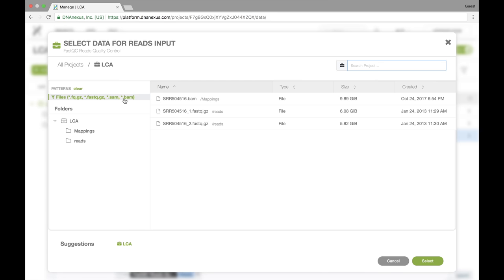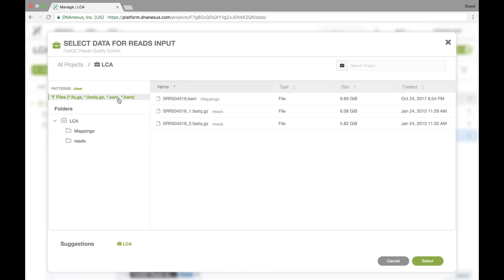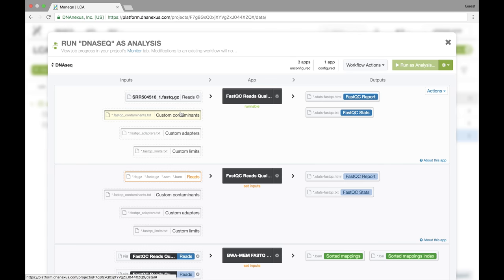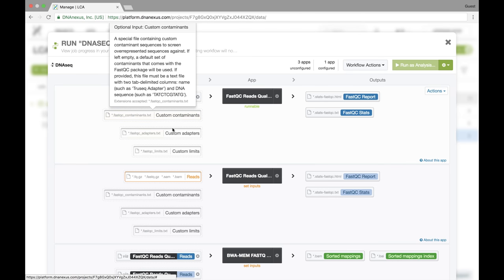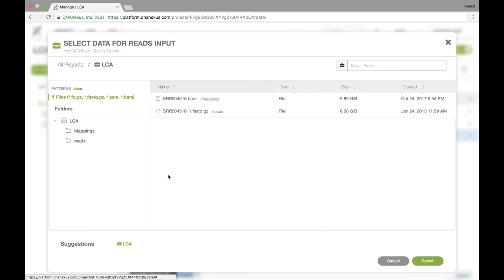We can toggle that on and off by simply clicking. We'll keep it on since we want fast queue files. And here I'll select the forward read. I do the same thing for the reverse read.